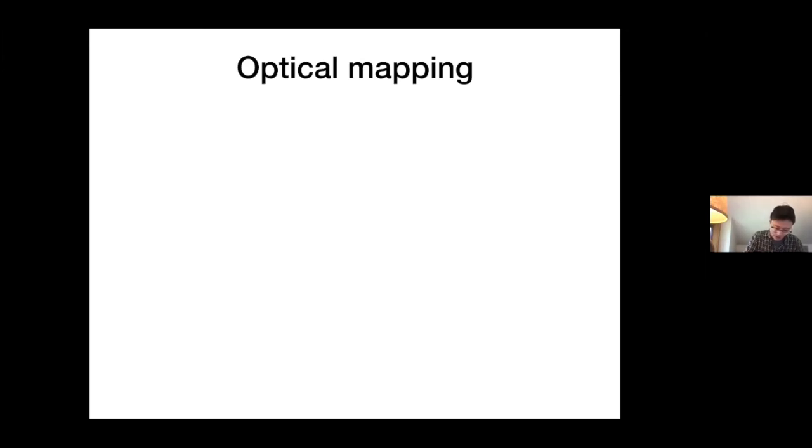So you have your DNA and you have restriction enzymes that recognize it and introduce fluorophores, right? And then you stretch it to a linear form, and the fluorophores are still attached on top of it. And then you have a really fancy camera on top. You can measure the distance between them, say 1 kb.